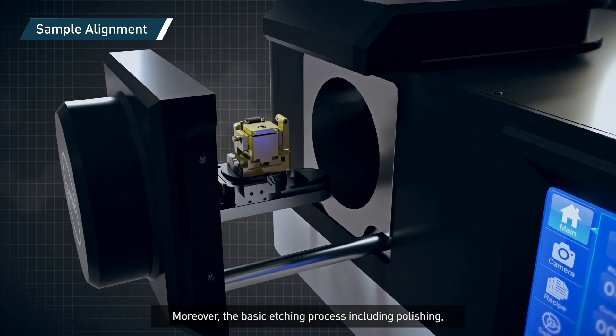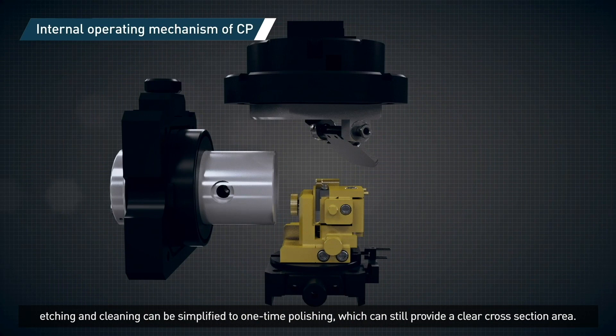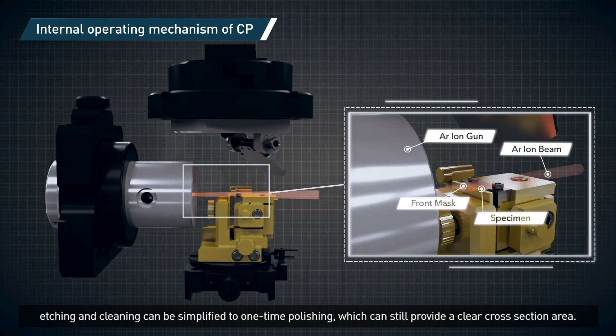Moreover, the basic etching process, including polishing, etching, and cleaning, can be simplified to one-time polishing, which can still provide a clear cross-section.